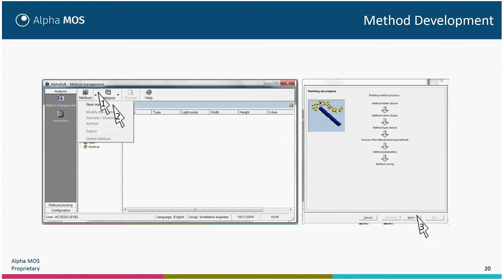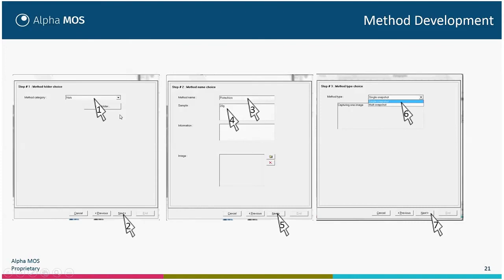In order to get an acquisition, you must first create a method for each product. You will set parameters to do the acquisition and data treatment always the same way. These acquisition and treatment parameters are gathered in what we call the method. For this, click on Analysis > Method > New Method. It will open a method wizard. Click Next, select the method category, then click Next. Enter the name of the method and the sample matrix. I advise setting a precise matrix to have repeatable analysis.